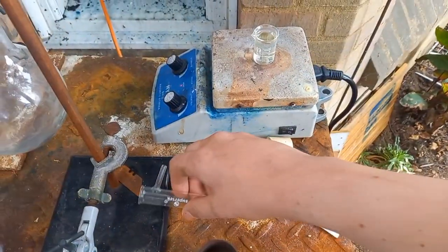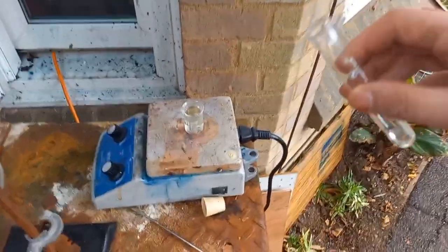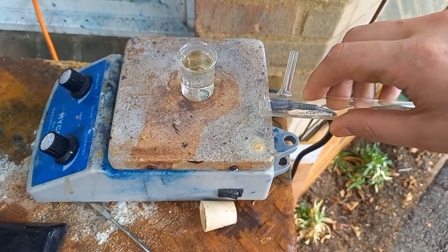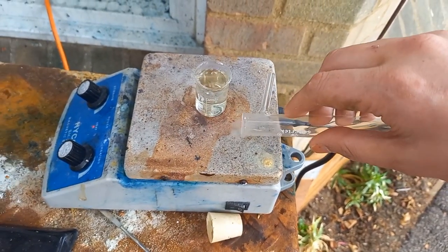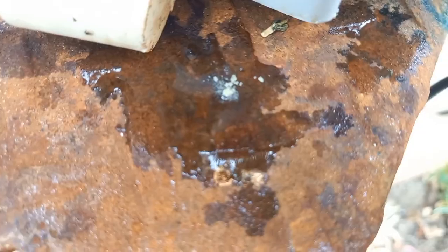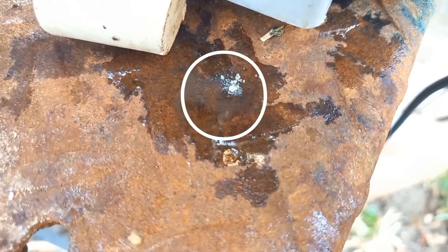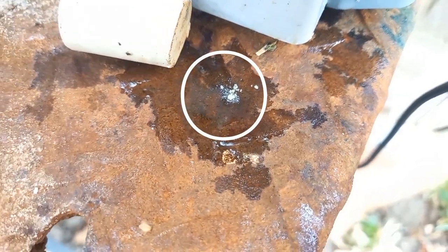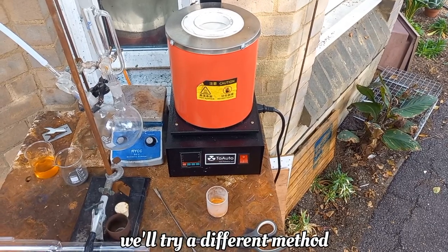It is out of interest — that solution, that experiment we did before. When we pull this out, basically that stuff — I don't know if that's bismuth nitrate. What if?